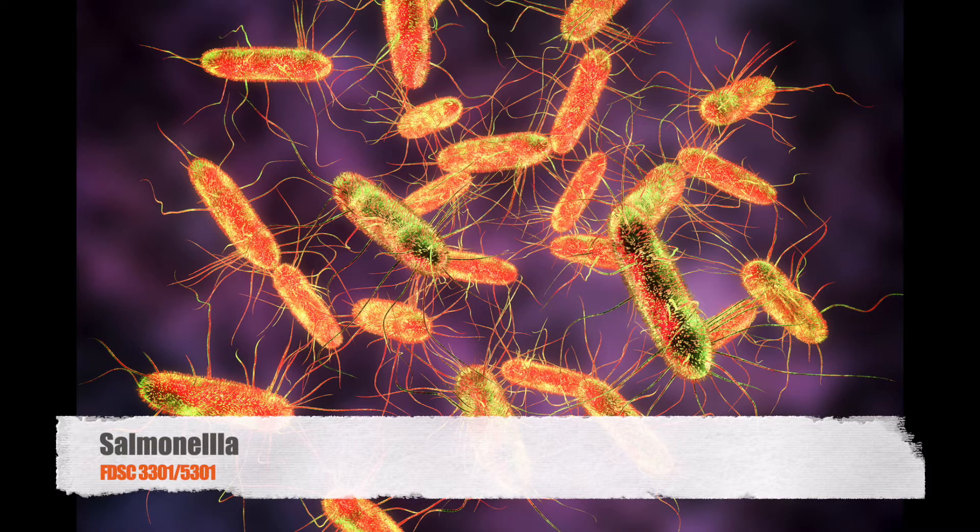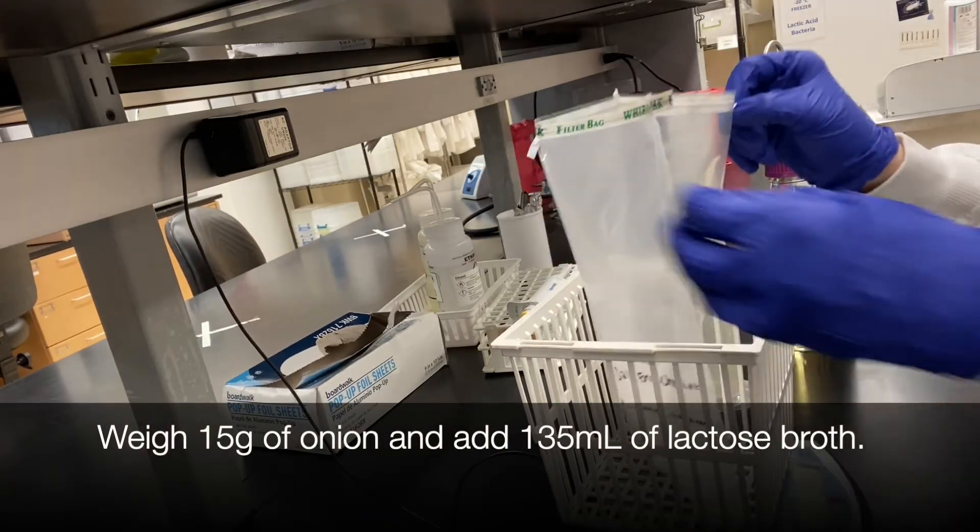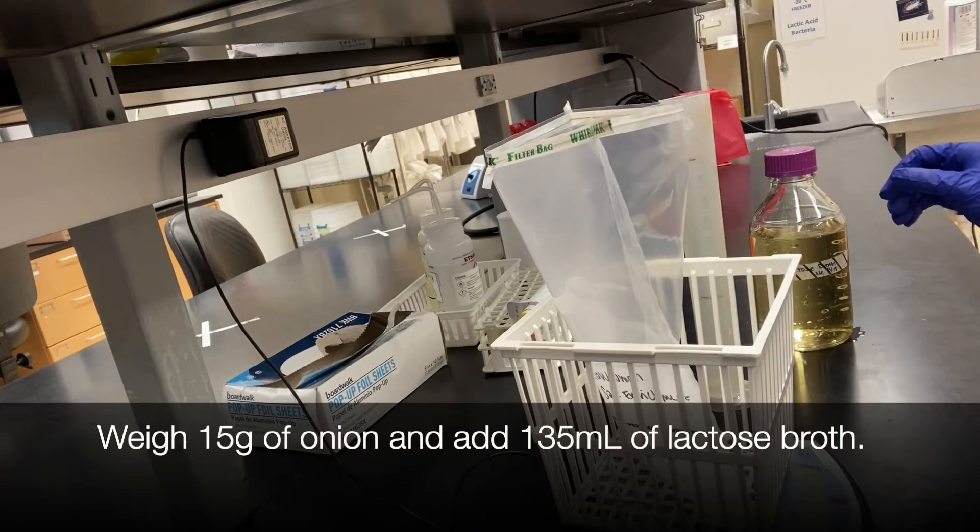In today's lab we're going to go over Salmonella. Step one is to enrich your sample. Weigh out 15 grams of onion and add 135 ml of lactose broth.